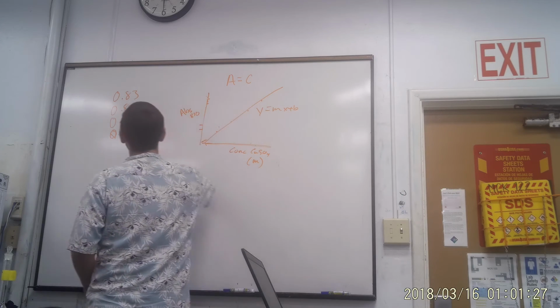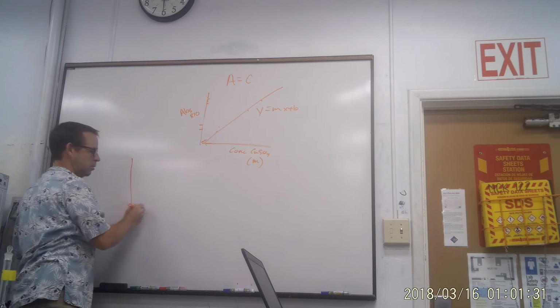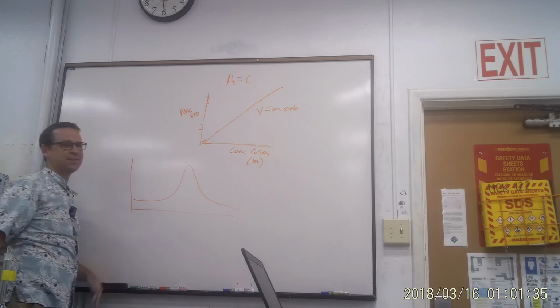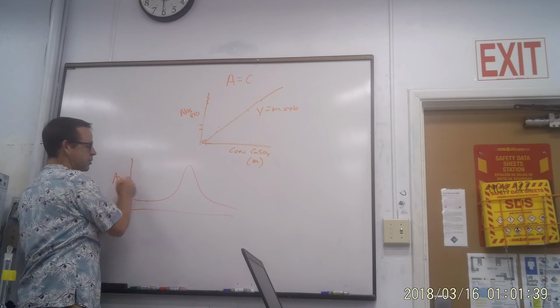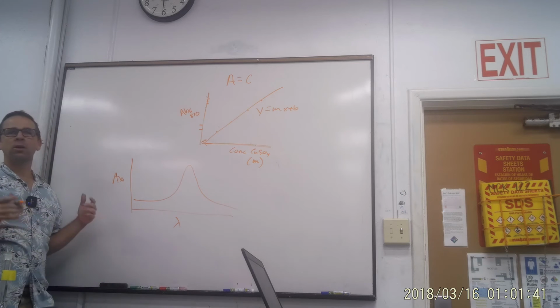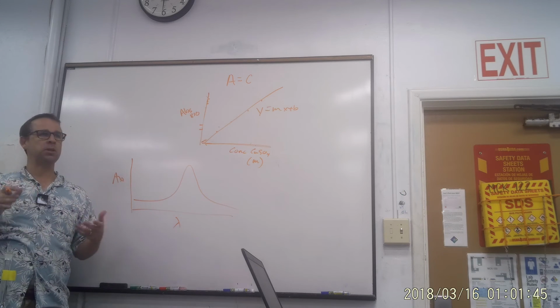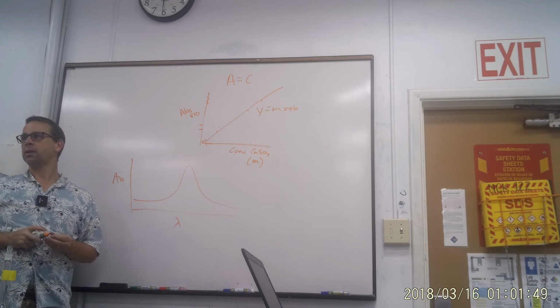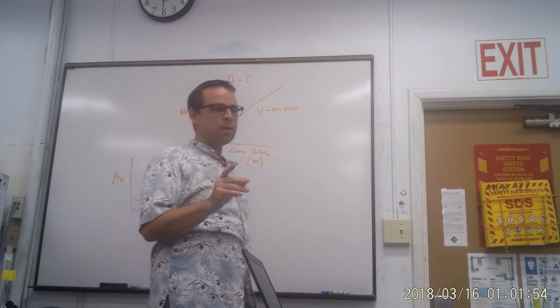I can't remember now if it was in this class or not, but oh yeah, it was. Some people were putting linear fits to this absorbance versus wavelength. What's the linear fit for? Is it just that you always do it? That scares me to death. This is serious business.